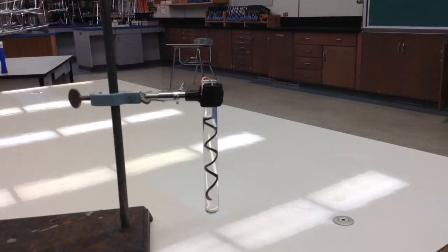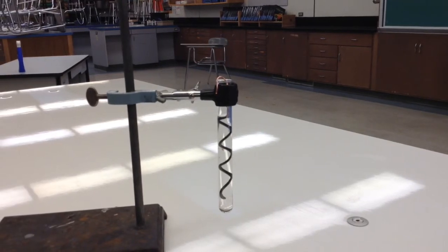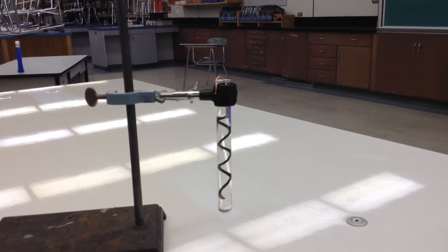There we go. So we can see that our copper wire is no longer shiny now that it's in the test tube, and we've got some stuff going on there.